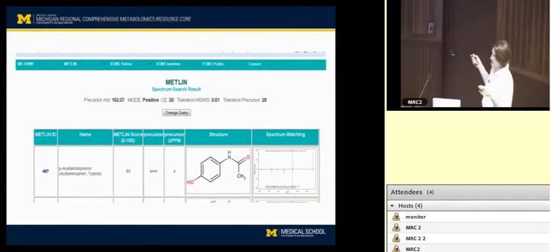And somebody asked a question yesterday, like, why aren't the peaks always the same? Well, lipidomics is maybe a slightly different situation, because their databases are mainly in silico, so they're just theoretically generated. But for metabolomics, there are a lot of reasons why this could not match. And the first reason would be just that the type of instrument you're using really affects what kind of fragmentation you see. The more energetic your fragmentation, then you might see more peaks here in your spectrum than they would have seen when they did it.